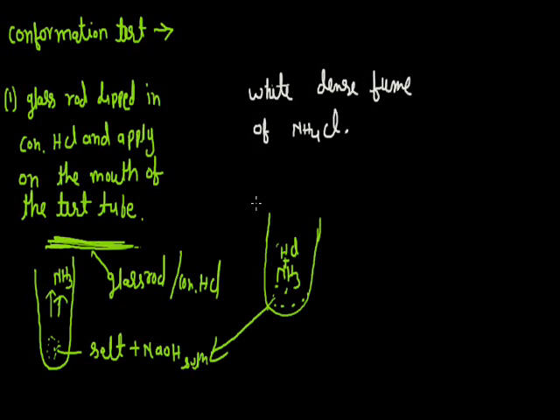So when NH3 and HCl react, there is a reaction and it forms white dense fumes of NH4Cl.